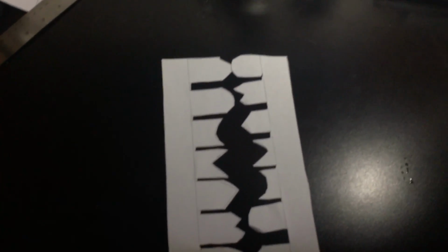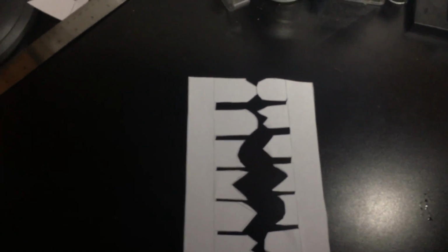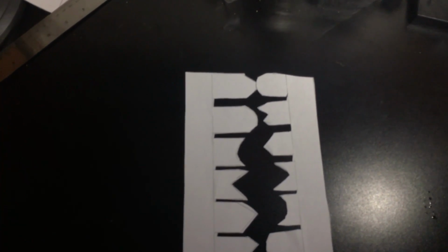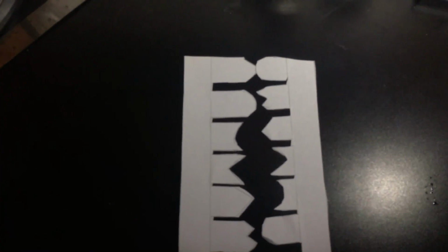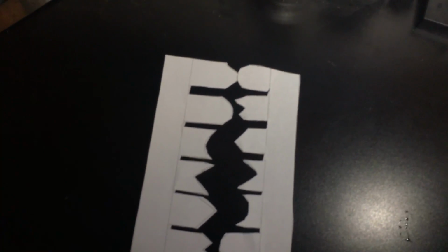Hello, welcome to part 3 of my PCR demonstration, where in this episode, our final part, we will be going over what happens at the molecular level of the process of PCR.